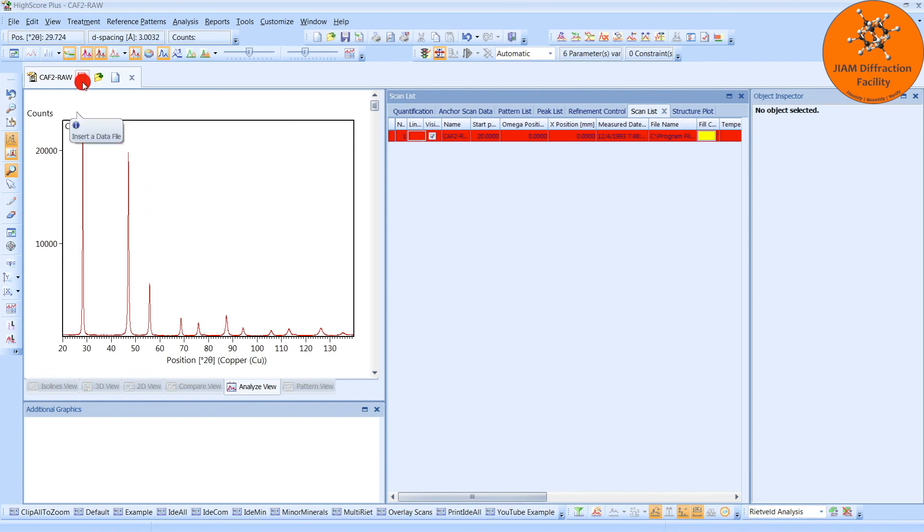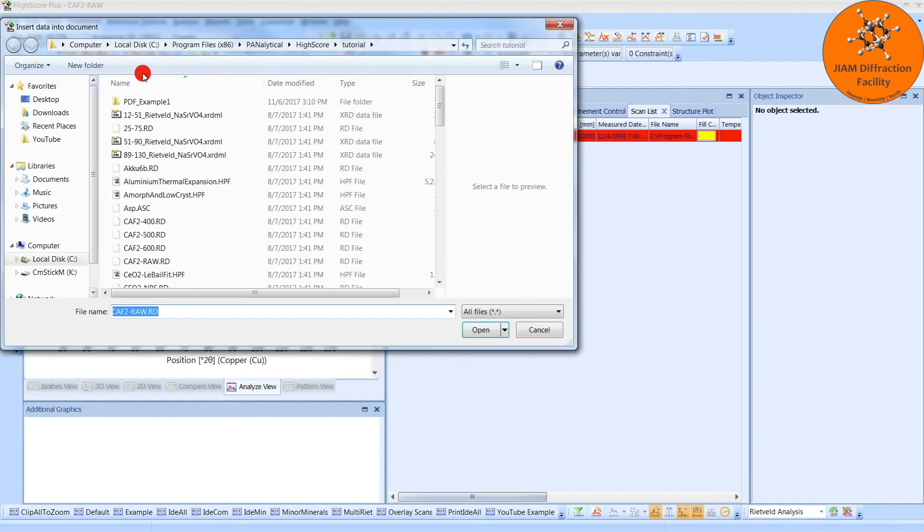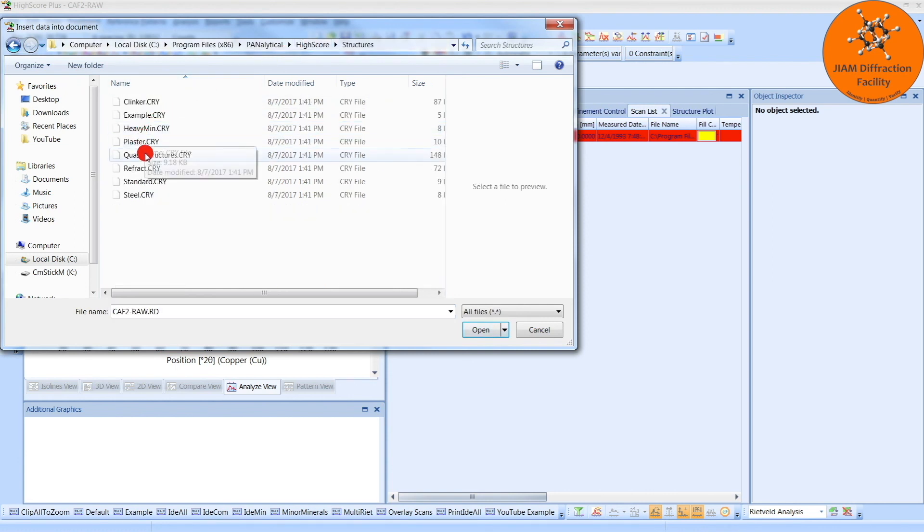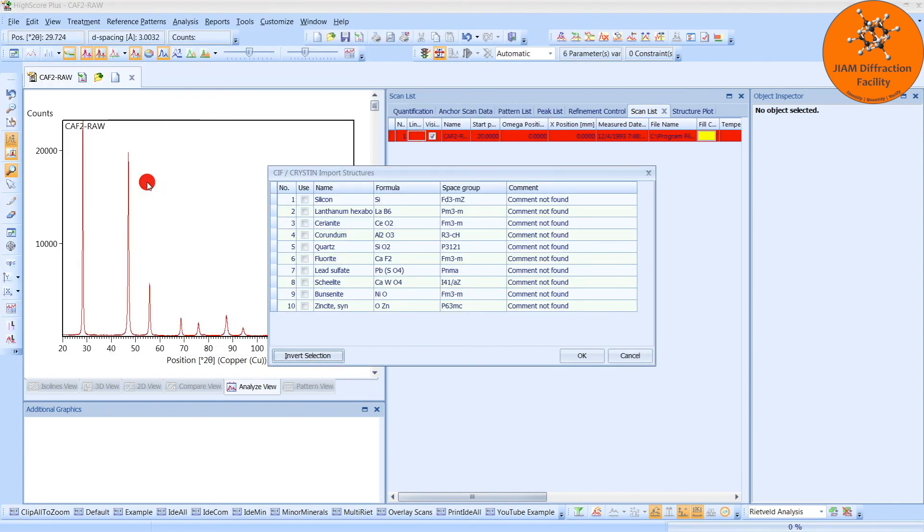So now that we have our diffraction pattern, I will go back, Insert, HighScore, I will go back to Structures, Standard, and this time we have Fluorite, so I will just choose Fluorite. Okay.